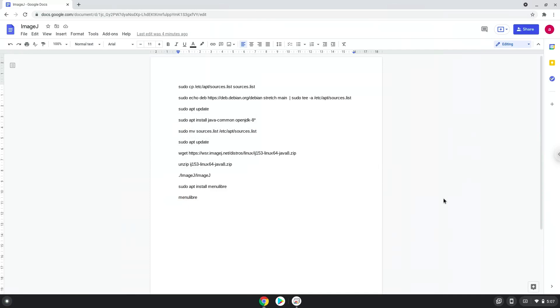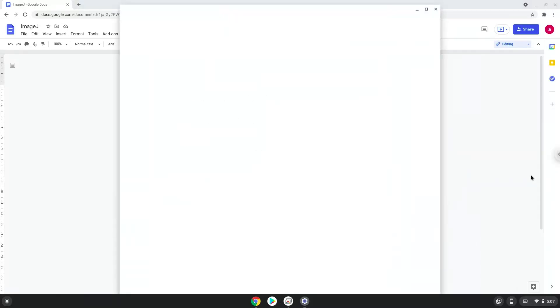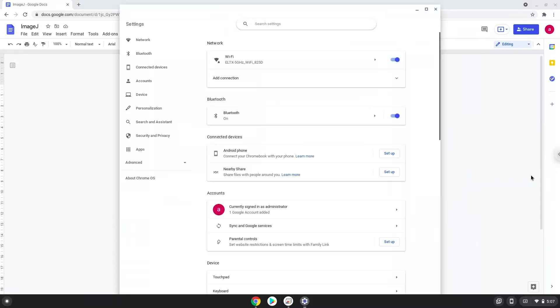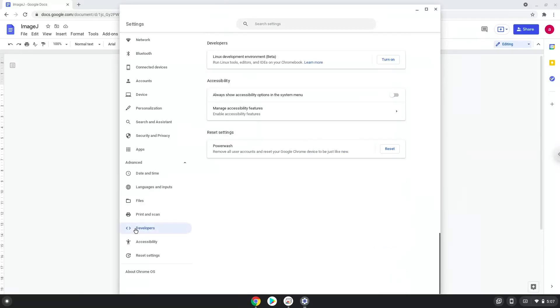To do this we will go to our system settings and click on the advanced section on the left panel. Now we click on the developers section. Now we will turn on the Linux apps.